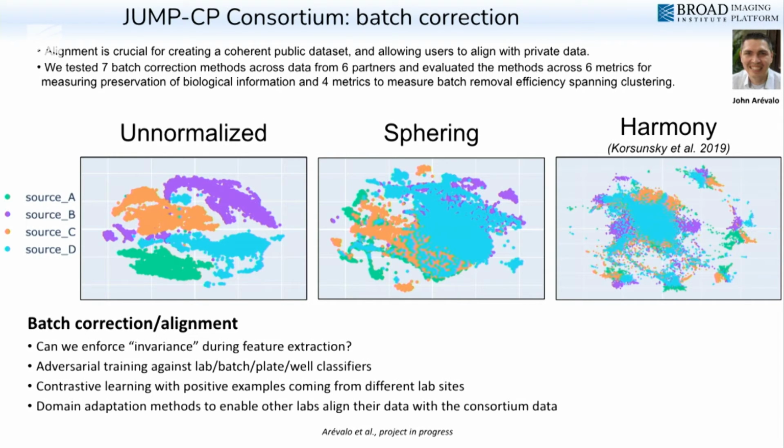And our effort here is to come up with strategies that could allow both correcting for batch effects and also, more generally, integrating data across experiments so that the large data set that we've built here is really something that can be a catalyst for others to build upon.